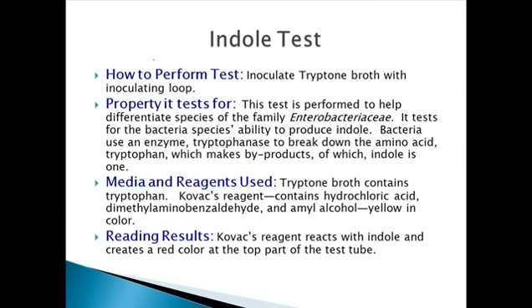And all these reactions I am going to talk about now are done with different genera of enterobacteria. As you have known, the tests are called the IMViC test. So always remember the name of this test. It is called the IMViC test. Sometimes this I is written in short form. Why? Because I means indole, M means methyl red, V means Voges-Proskauer, and C means Simmons citrate. So we have the indole, methyl red, Voges-Proskauer, and citrate tests. The I is there to make it sound familiar for us, IMViC. Otherwise IMVC is tough.